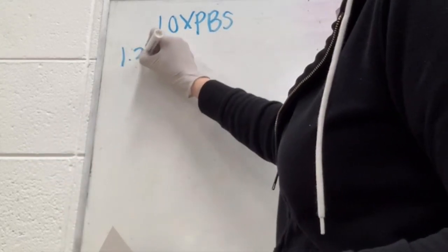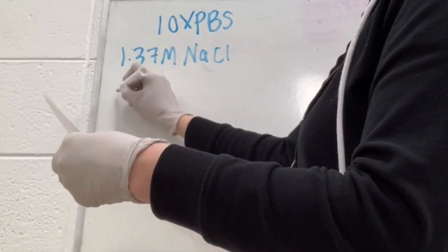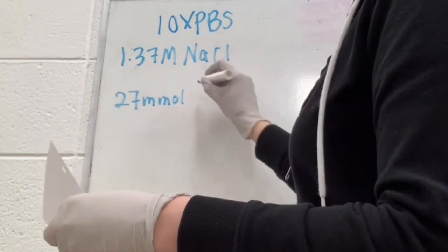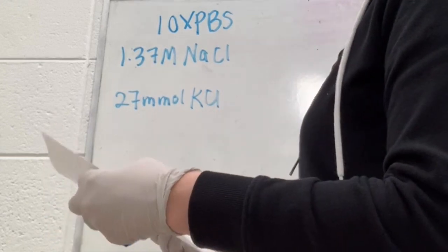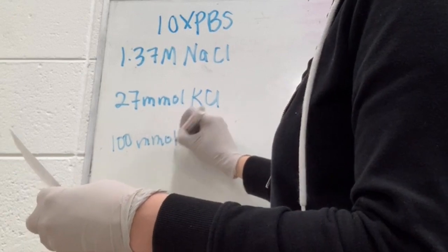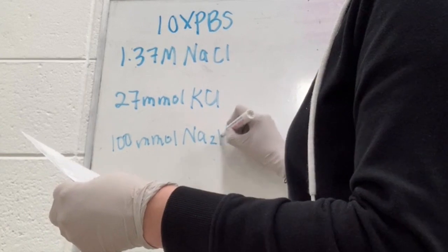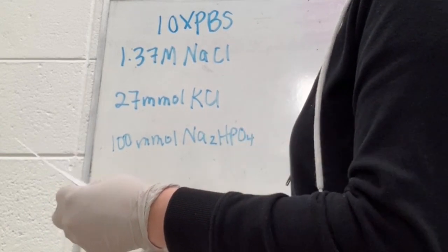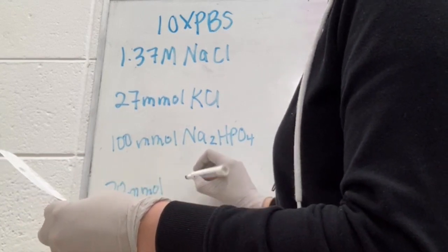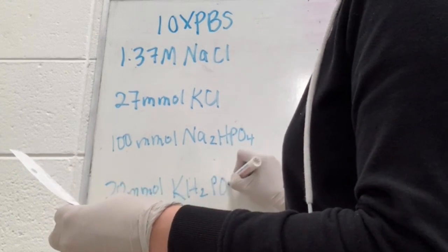It's 1.37 molar NaCl, 27 millimolar KCl, 100 millimolar Na2HPO4, and 20 millimolar KH2PO4.